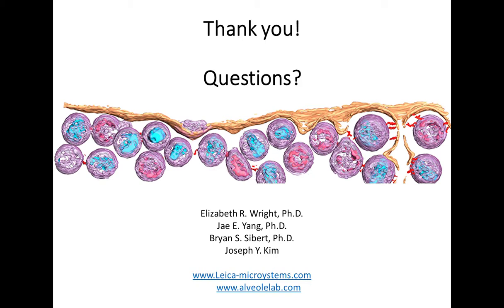This next question is actually for you again, Joe. Which cells can be micropatterned on EM grids?